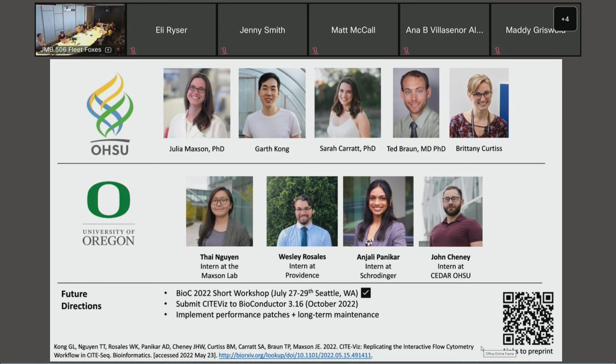Great work. Especially the idea of gating is pretty useful because I've been struggling with not PBMC, but some other cell types where you have to figure out what are the new combinations of protein markers which can be useful. So one suggestion would be to suggest, at the time of gating, what protein markers can be useful to gate against. If there's a new data set you don't really know. Basically, if you run find all differential markers based on some clusters and then suggest these as potential options to gate against, that might improve the usefulness of the gating strategy. Because the unique IP of this method is gating.